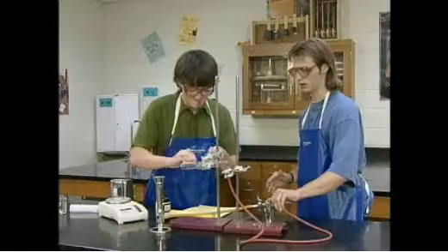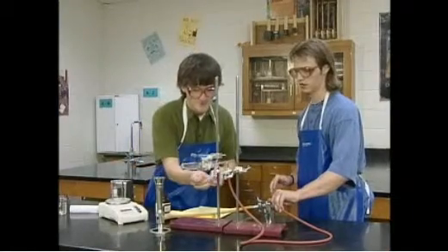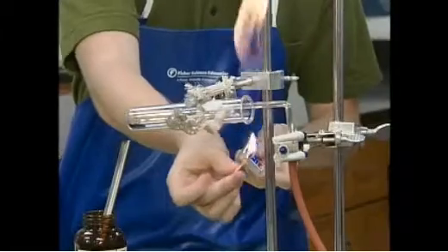The students are adding methane gas to the test tube, which they then light at the mouth of the test tube.